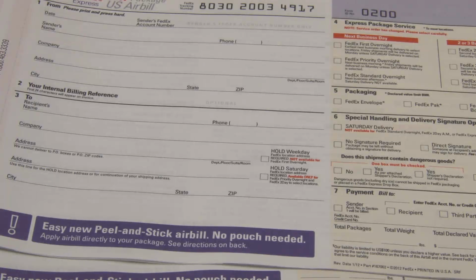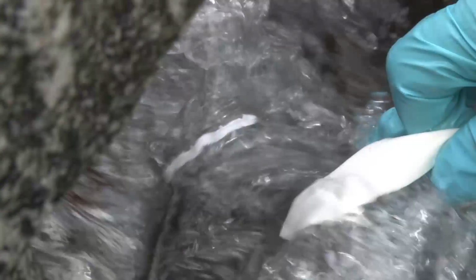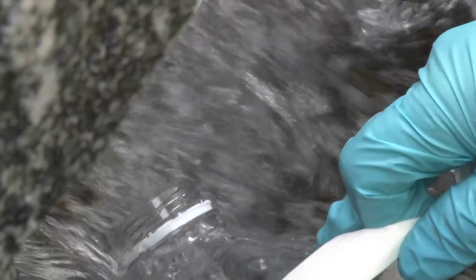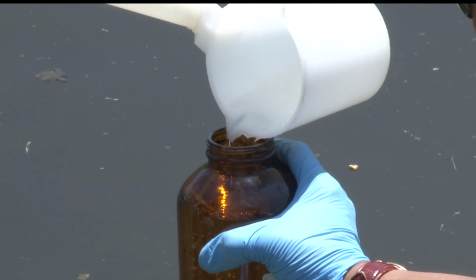Ship the cooler with samples to the designated laboratory. A legal chain of custody may be required to accompany the sealed cooler. Refer to your SAP. You should now be familiar with the process of stormwater sampling, including collection, handling, custody, and shipment procedures.